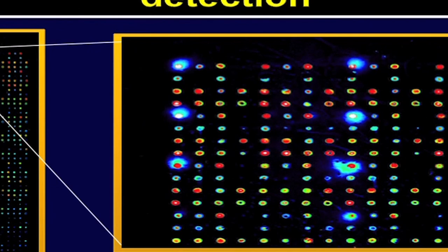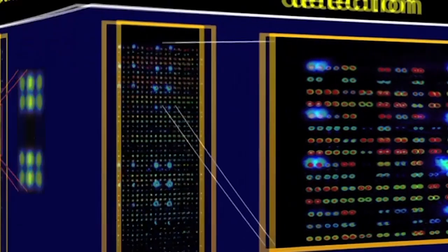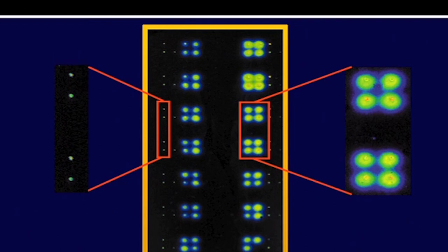If you are looking for different types of immunological response in biomarker discovery, etcetera, you need to ensure that immunoglobulin IgG is printed at varying concentrations. It can also be used for statistical analysis that is run by the biostatistician, so that different types of protein expression can be normalized. Control features and QC checks are shown here in this slide. The same gene has been printed 4 times in the blocks, repeated, and then negative controls are used to estimate the background noise.